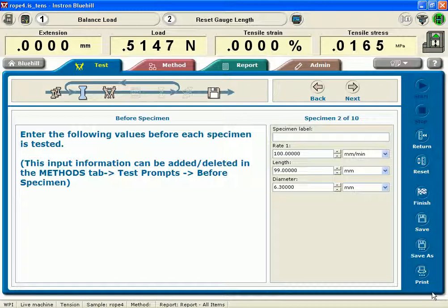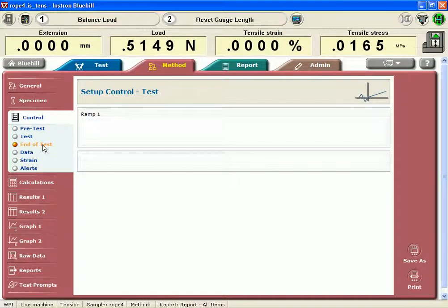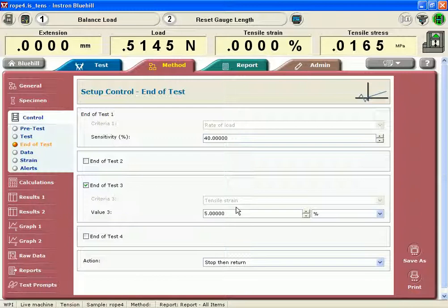So if I go under my method, I have my ramp rate chosen. My end of test is I'm testing a polypropylene rope at 5% strain maximum it's going to go to, and a failure criterion.